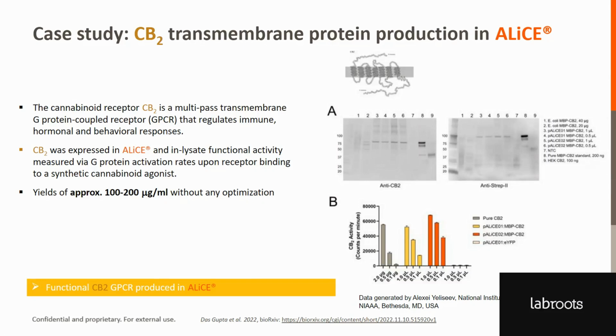It's quite toxic, and not only is it toxic to the cell, but the purification of these proteins is also famously tricky. How to keep these membrane-bound, lipophilic proteins happy and stable and functional in the various protein purification workflows that are all mainly targeted towards soluble proteins.